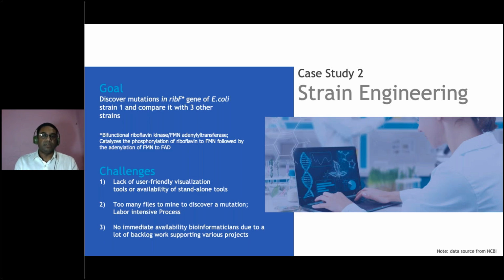coli strains. According to them, the typical challenge is the lack of user-friendly visualization tools, or even if they are available, they are standalone. So you just can't link them in a typical workflow.